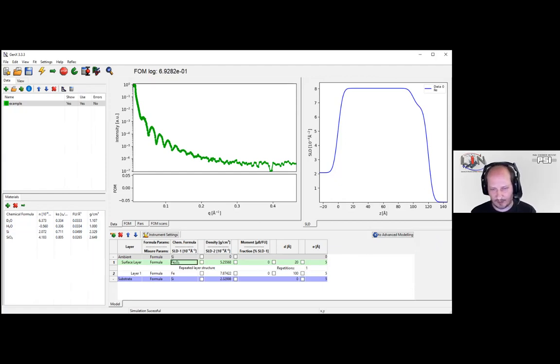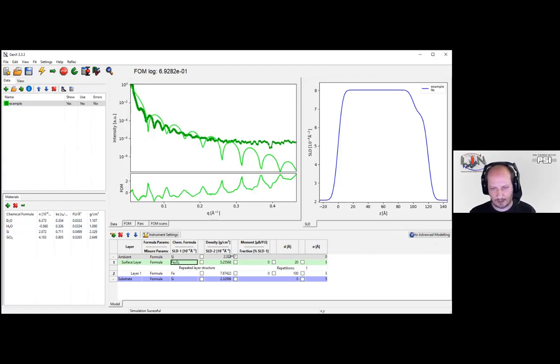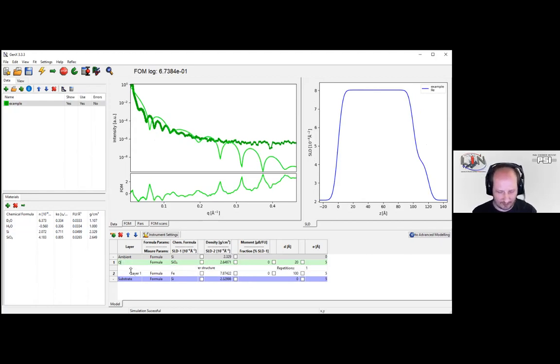And so if I press enter, the density is directly put into the model. I do the same with the silicon oxide, which was also found. Obviously, I already put everything in there to make it easier. I call this oxide, and this layer I call, let's say, poly.